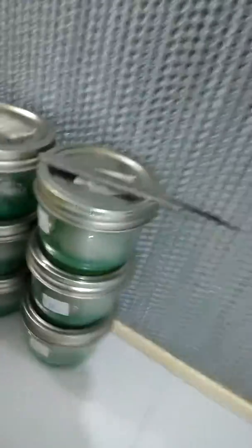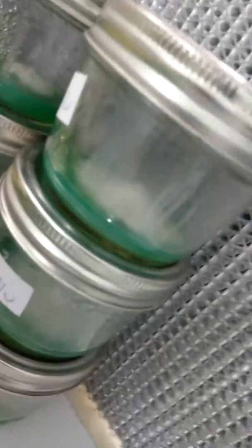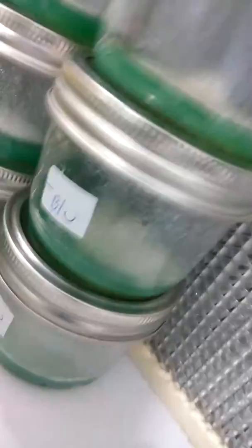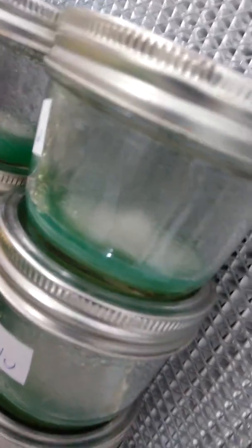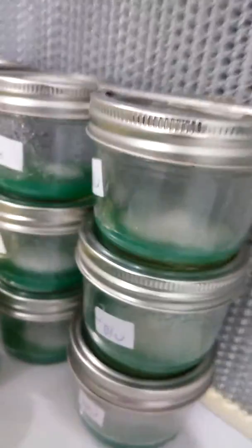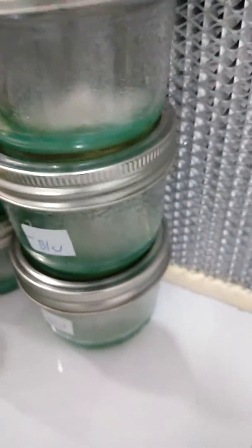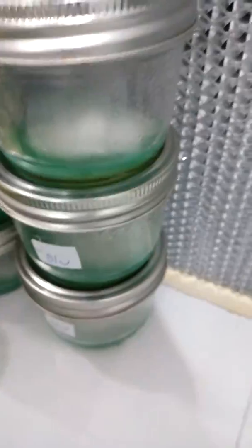The plates that are good right now, like this blue oyster plate here, are not contaminated in any way. The transfer prior to this was clean as well. That means this one's clean, and we're going to transfer from there. And we'll end up using these for grain inoculations today, probably, maybe tomorrow.